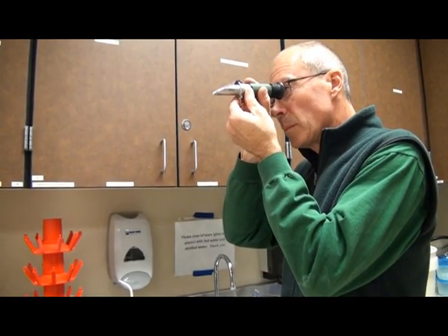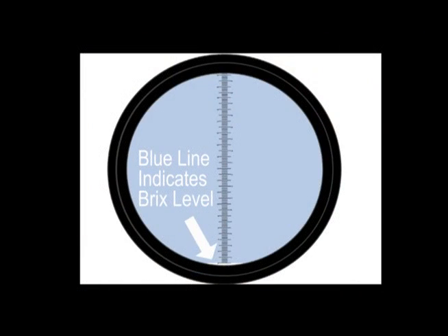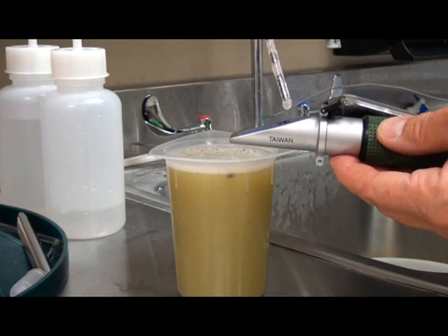Observe the sample measurement in the viewfinder and verify the sample measurement is 0.0. Then wipe the prism surface dry with a Kimwipe. The refractometer is now ready for sampling.